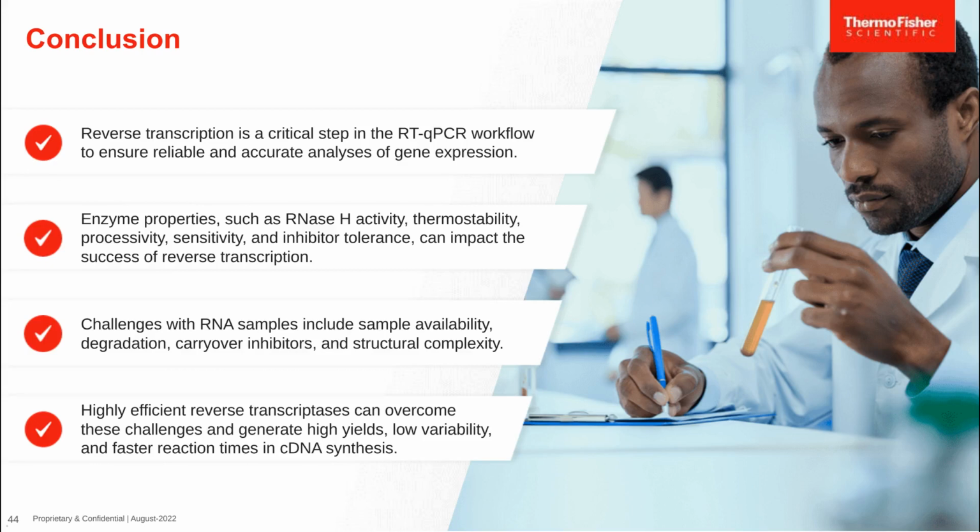So in research these days, we're using more and more relevant but technically challenging samples, such as blood samples, tissue samples, biopsies, and others, which often yield low input, degraded, and/or inhibitor-containing RNA. One of the biggest challenges with those sample types is how to get highly reliable gene expression data. In all RT-qPCR assays, but especially in these circumstances, reverse transcription is a critical step that needs to be carefully optimized to ensure reliable and accurate gene expression interpretation.